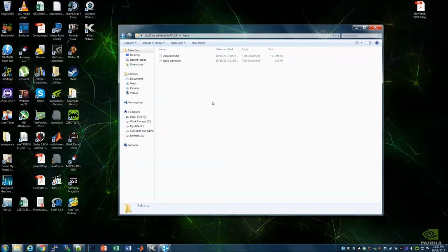This sample dataset is the Linnarsson dataset published a couple of years ago, of 3005 single cells from adult mouse cortex. So you can run bigSCale and test that everything is alright by analyzing this dataset, and then you can replace these files with your own dataset.